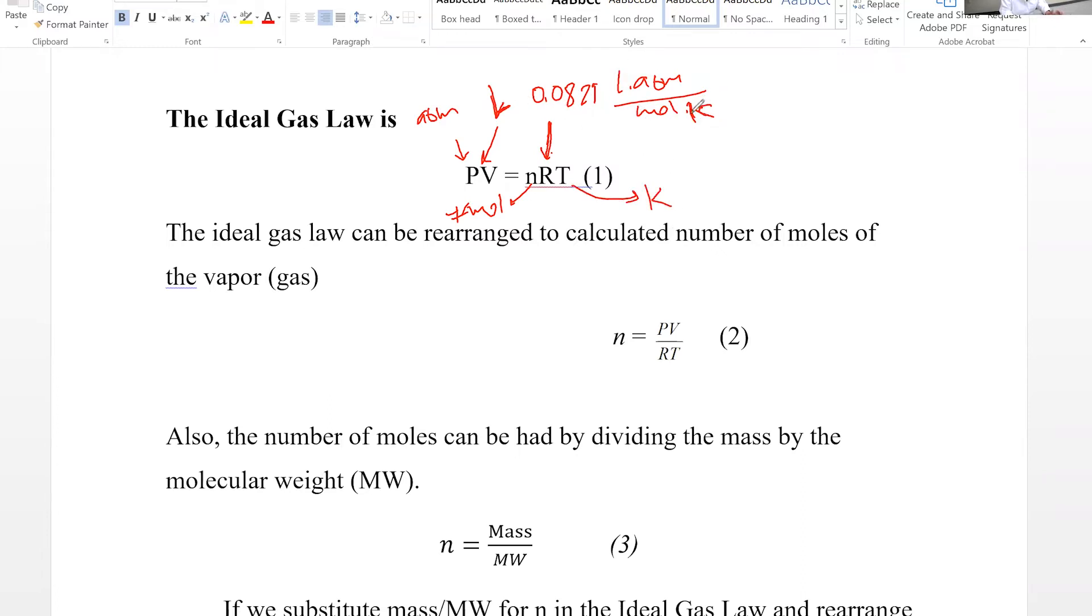If we rearrange this formula we can find the number of moles of the gas with the condition that we measure or record the pressure experimentally. We find the volume experimentally and the lab manual tells you exactly how to measure. The video shows how to measure.